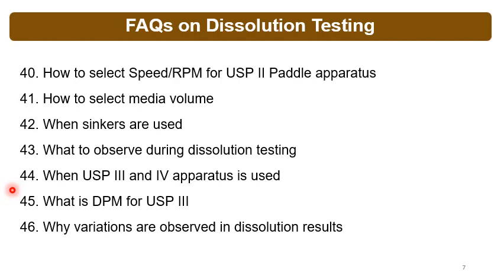What to observe during dissolution testing? Whenever you are putting the tablet inside the dissolution vessel and you are starting the dissolution test, at that time you should observe how the tablets are landing inside the vessel. Is there any sticking to the vessel wall or to the paddle? And you should observe the physical behavior, whether the tablets are moving inside the vessel, whether they are dancing, spinning, or revolving or rotating with the paddle. And you should also observe the disintegration pattern.